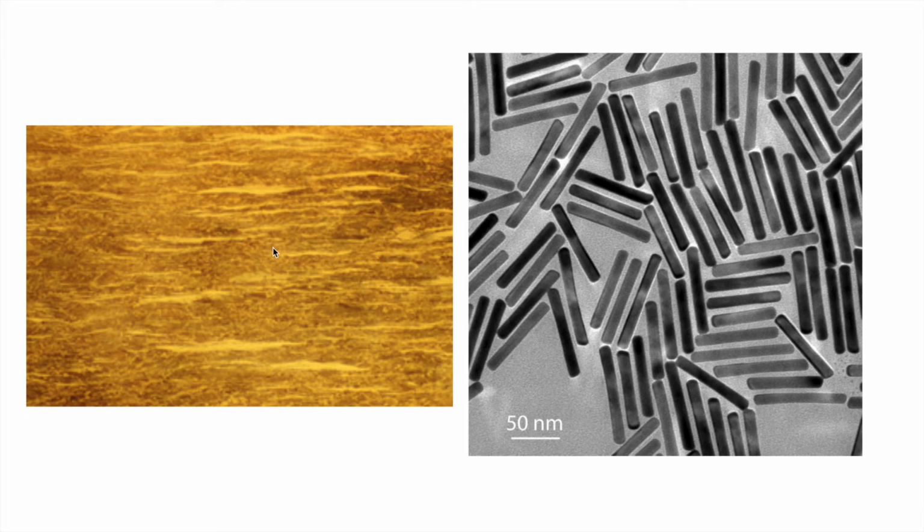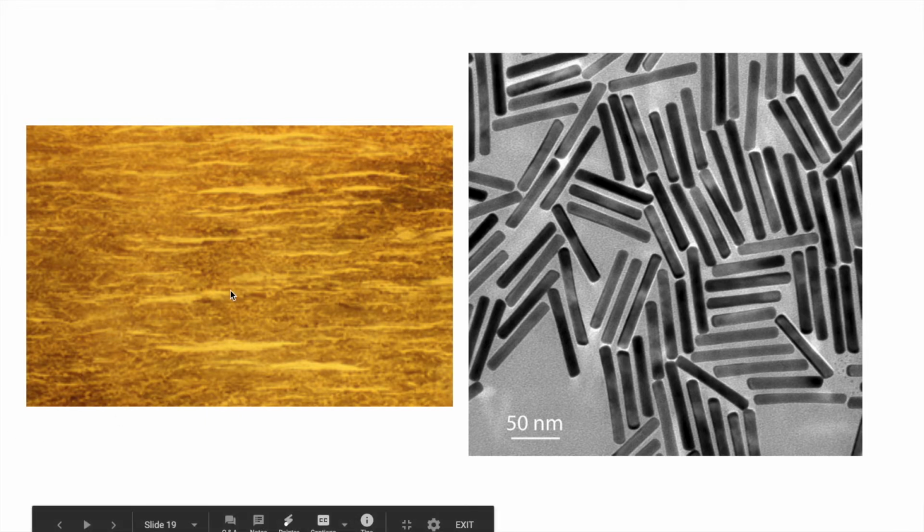And so the relative intensities of the diffracting peaks that I would expect for brass are going to be different, because I have a very predetermined arrangement of those grains. So this is something we call preferred orientation or texturing. This can affect the relative intensities of X-ray diffraction peaks, sometimes completely excluding certain peaks. So that's the example of a rolled sample.